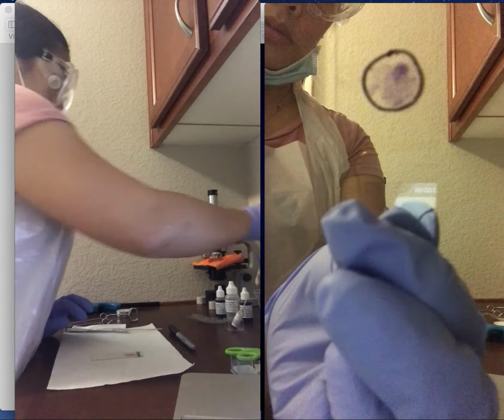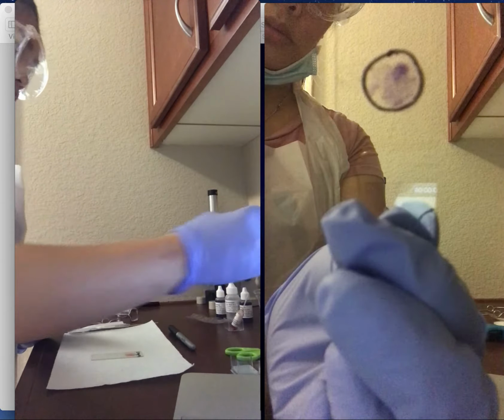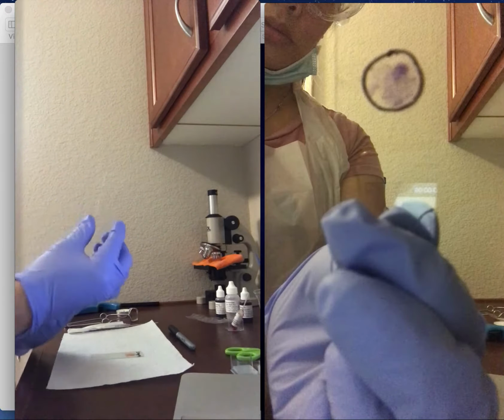Next, we get a clean blank slide and spread the Congo red stain across the slide.